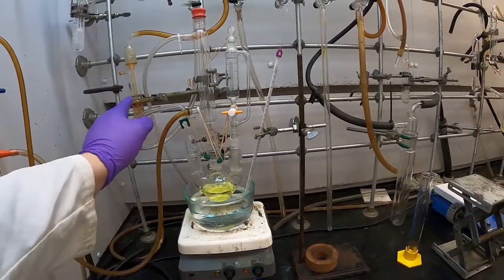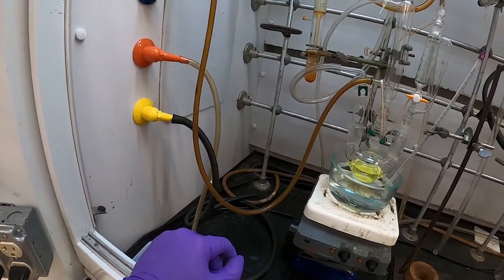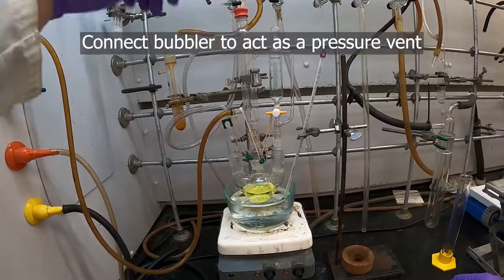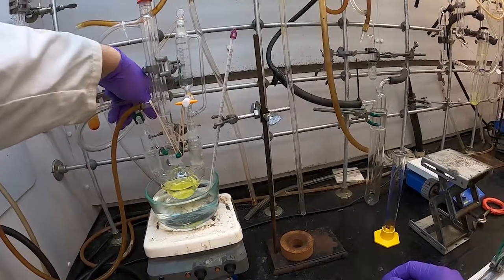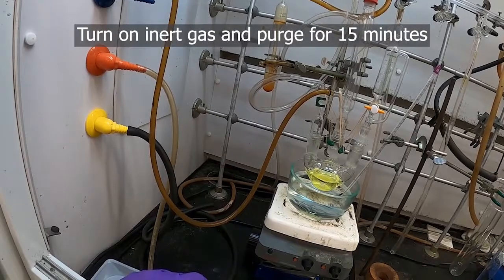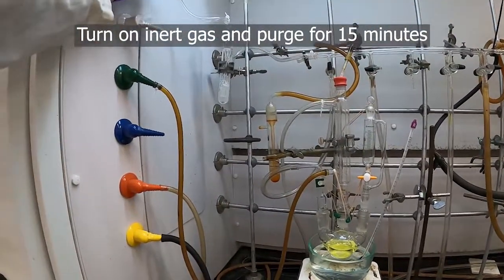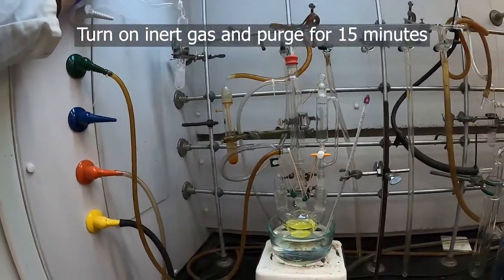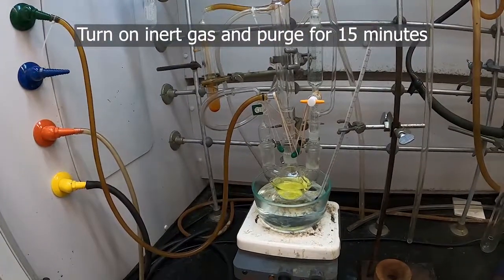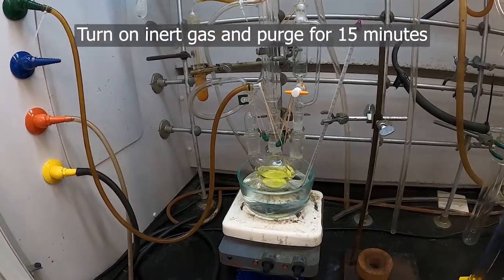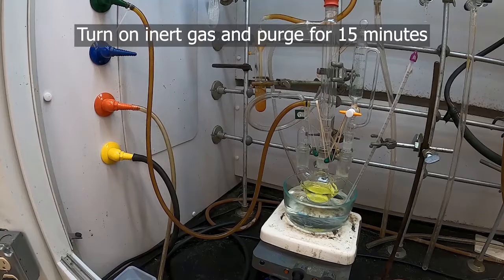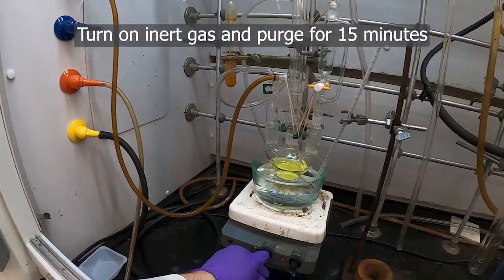So now that that's all set up we can begin our nitrogen. We'll take this needle and bubbler and insert that into the septum at the top of our condenser here. Make sure to open this key, and then turn on the nitrogen. We can start the flow a little bit. Now start our stirring.